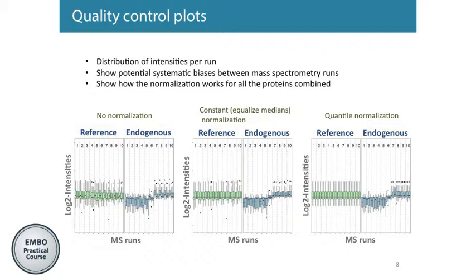But if you make them the same, this distribution goes up and everything becomes similar. So in this case, maybe the conclusion from here to here is quite different. If you use the normalization for label-free cases, maybe the difference in distribution disappears, and your conclusion is just the same as before. That's why we need to consider whether the normalization is suitable for your data set.